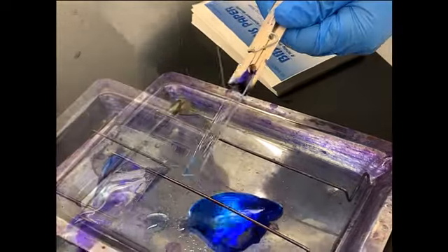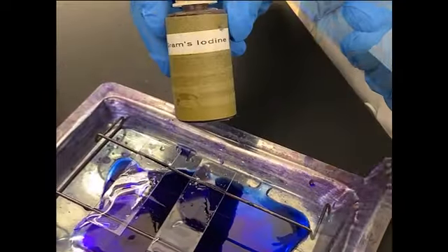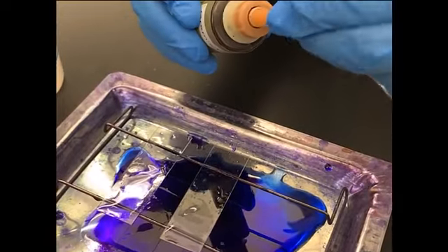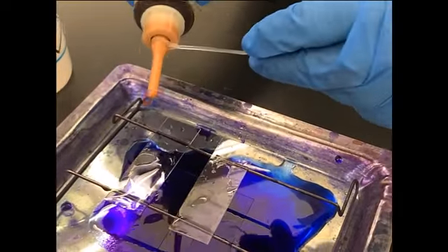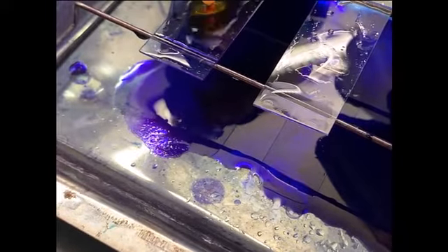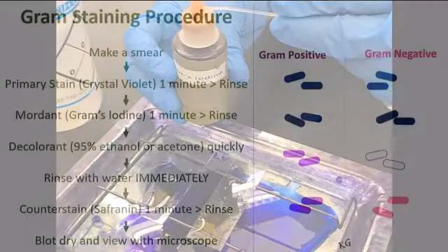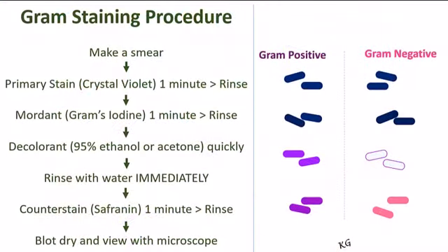Tap off any excess water and flood the slide with gram's iodine. Allow it to stand one minute, and then gently but thoroughly rinse. If you are making several slides, you can do these steps all at the same time.